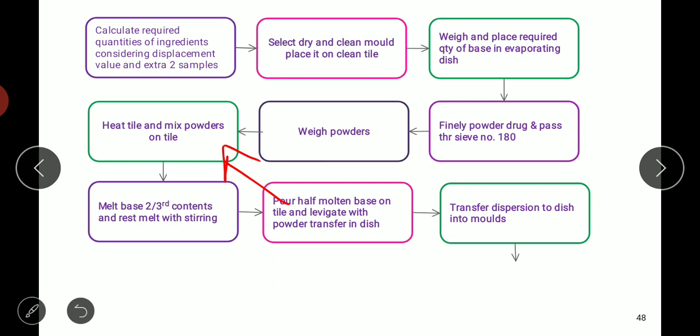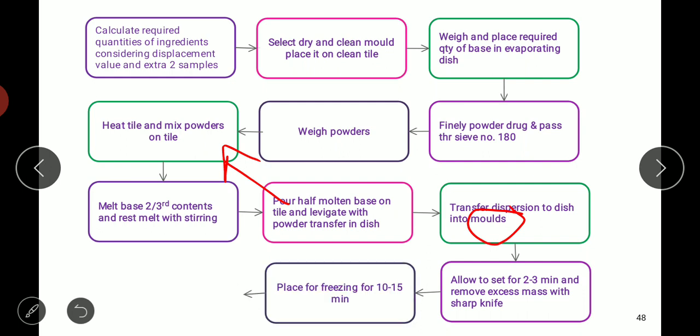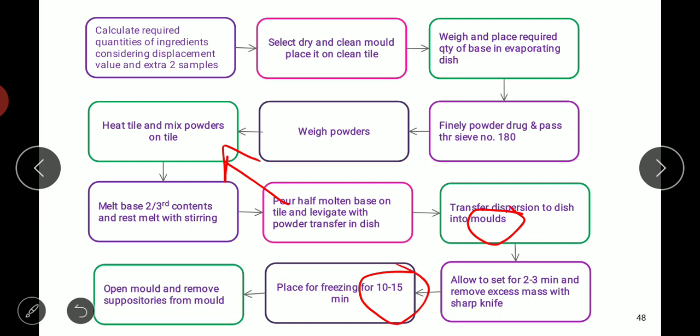This mixture is transferred back to the evaporating dish and then poured into the molds. The molds are kept for two to three minutes and then we remove the excess quantity of the mixture using a sharp knife. To solidify, we keep the molds in a freezer for 10 to 15 minutes and finally collect the suppositories from the lubricated molds by opening them.